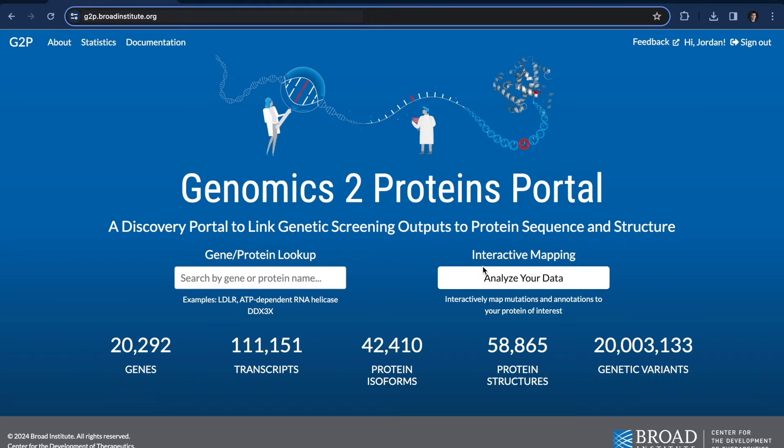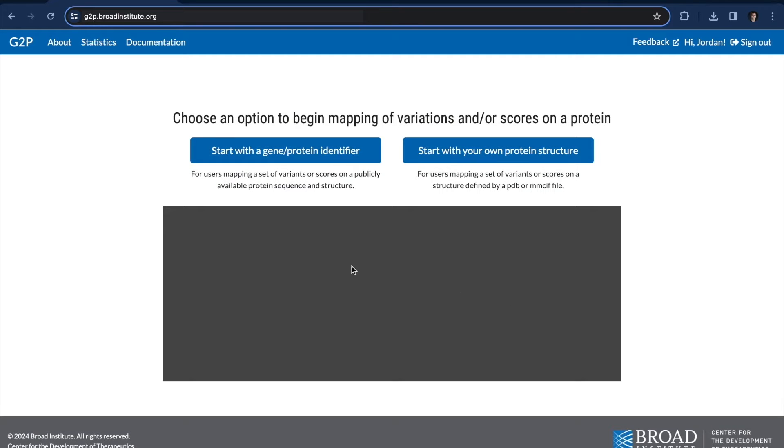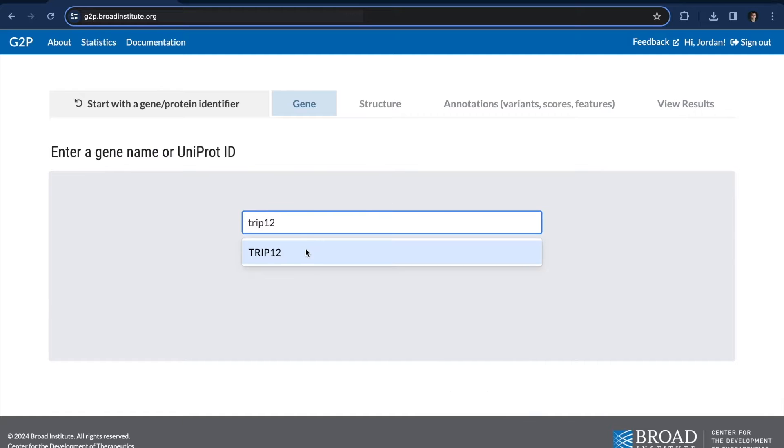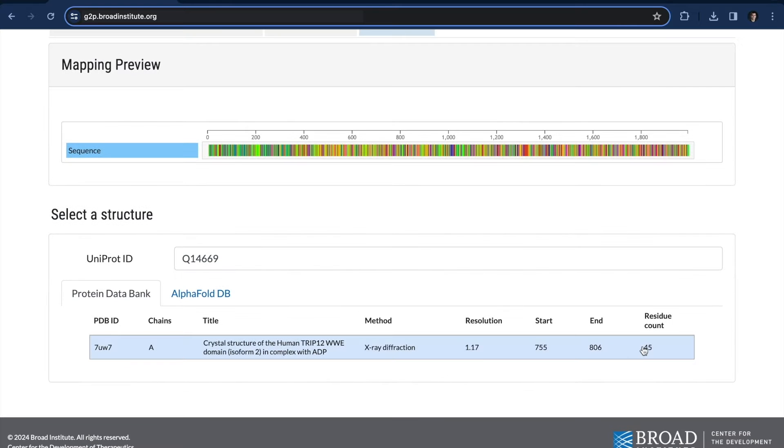So first off, let's go to interactive mapping and select TRIP12. I can see that there's only one existing experimental structure, but it's only 45 amino acids long. To have better coverage, let's select AlphaFold.